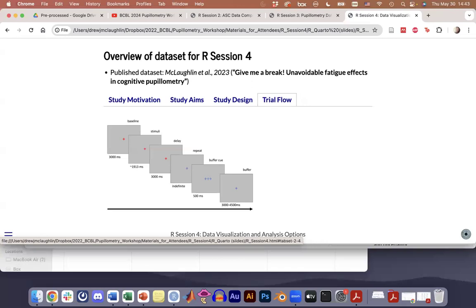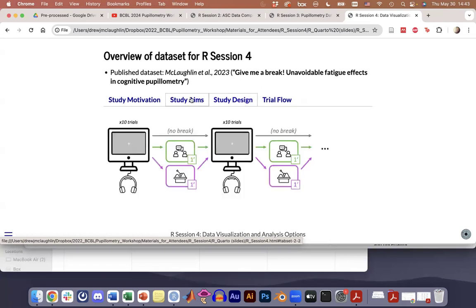It's the same exact thing on every trial. There is no other layer of conditions. There isn't an easy noise condition and a hard condition. It was just one level of noise, one task. And what we are interested in is the difference between these three groups who did the exact same set of 80 trials of speech and noise perception, but their pathway through this series of 80 trials is a little bit different.